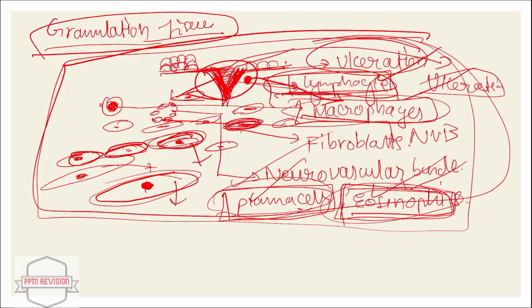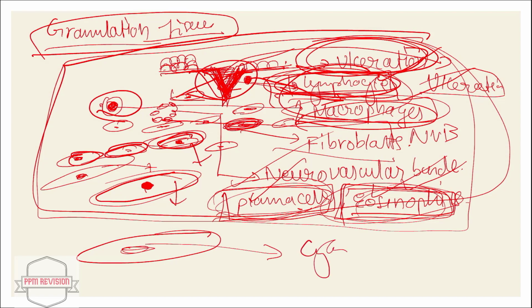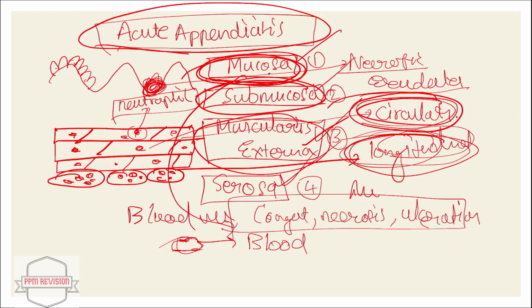So now let's continue. Pathology slide revision. Firstly we saw the granulation tissue. Granulation tissue has a V structure. This is nothing but the ulceration, and then we also saw, we clubbed it into two, the lymphocytes and macrophages, as well as the presence of other two cells, right? The foam cells? No, the macrophages, lymphocytes, eosinophils, and the plasma cells. I repeat, plasma cells, eosinophils, and also the lymphocytes and macrophages. And we have seen the characteristic property of the fibroblastic cells. It has a cytoplasm as well as the central nuclei.